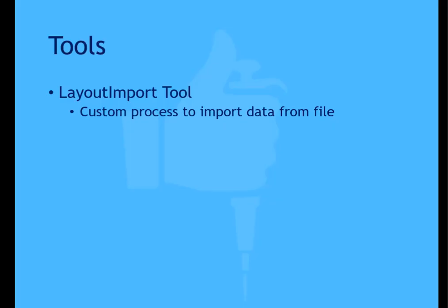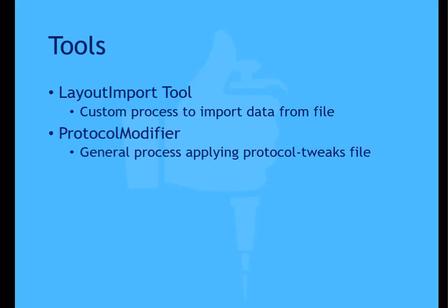You can think of the LayoutImport tool as a bridge between how your layout data is arranged in your file and a consistent format as used by MyAssays Desktop to modify a protocol configuration. If your layout files match the arrangement used in this example, then you can use this LayoutImport version. If your files are in a different format, please reach out to us for assistance in obtaining your bespoke LayoutImport tool.